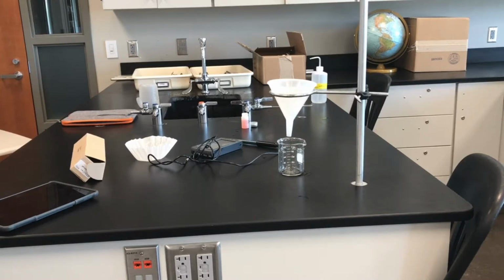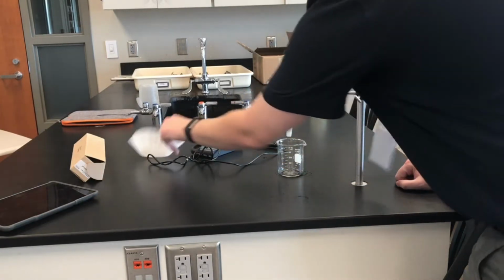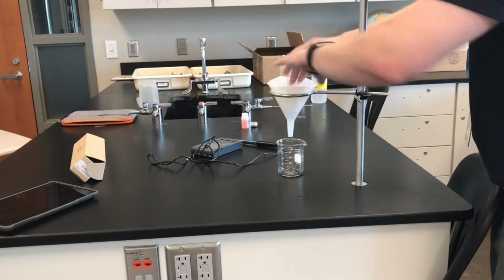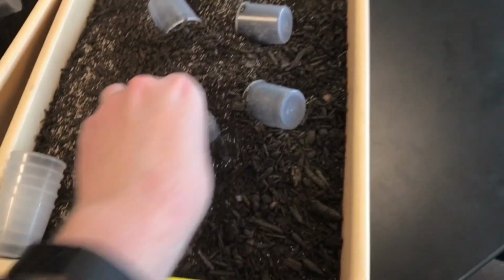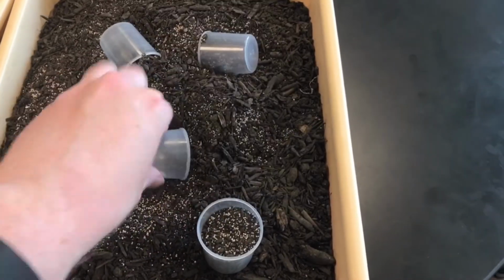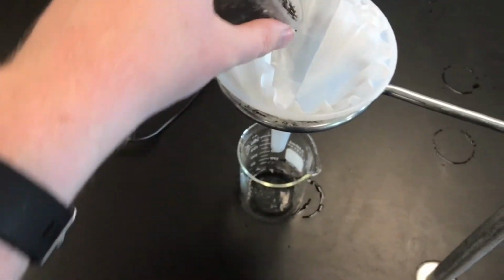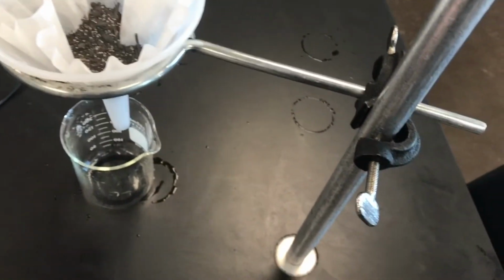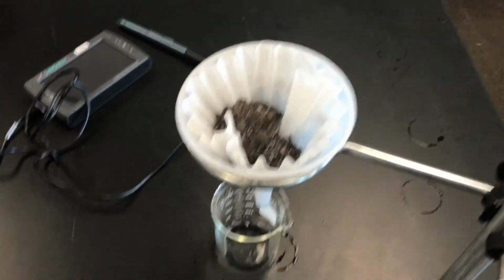Okay, so this is going to be our setup for part 2. It's going to be very similar to the same setup that we just did, but now we're going to be using soil B. So once I've cleaned out everything, I'm going to replace a beaker under the funnel. I'll put on a new coffee filter. And we're going to grab 2 scoops of soil B. I'll put those in right away. So we got soil B.